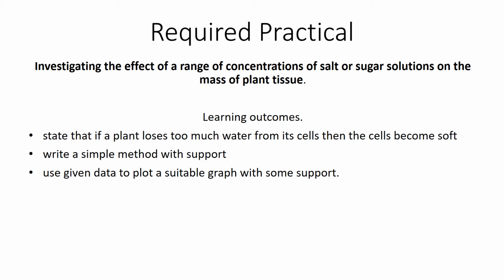Hi, Ten, and today we're going to be looking at another required practical, particularly osmosis, and we're going to be investigating the effect of the range of concentrations of salt or sugar solutions on the mass of plant tissue. Sounds a bit of a complicated one, but it's simply we're just looking at water moving, and I'm going to explain how that happens in a second.